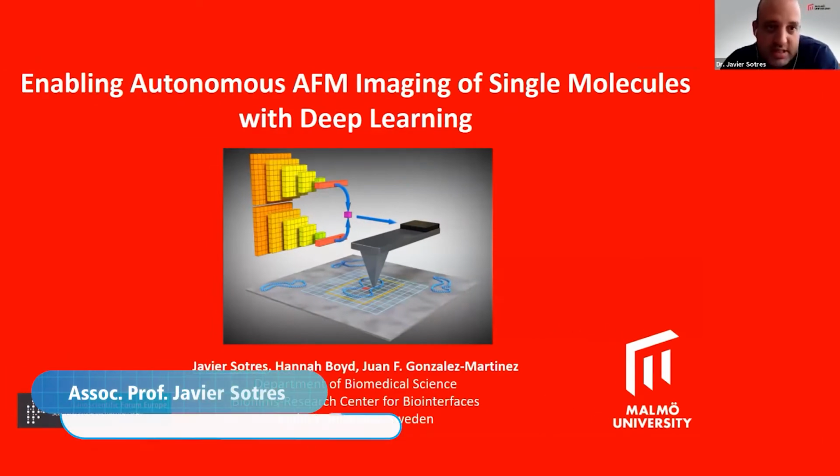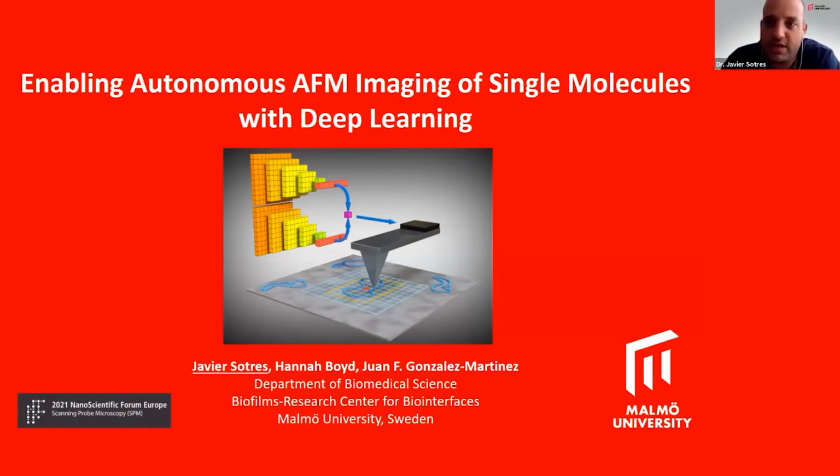So I will present a recent work where we automated the operation of an AFM for the purpose of imaging single molecules. And I will put the focus on how we use deep learning techniques for some of the steps involved in this process.